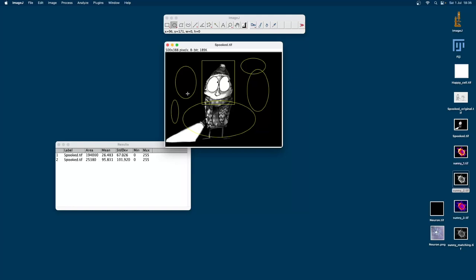But if you have an overlay, that's really something that's used in ImageJ for display, or for retaining your regions of interest, but it doesn't influence the measurements. It's only the active region of interest that does, and that may or may not be stored in an overlay. But if it isn't an overlay, you need to activate it in order for it to make a difference.